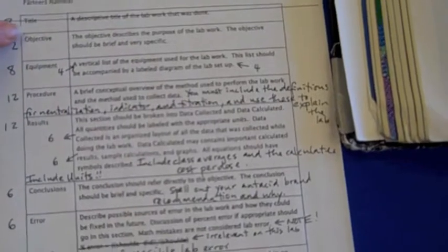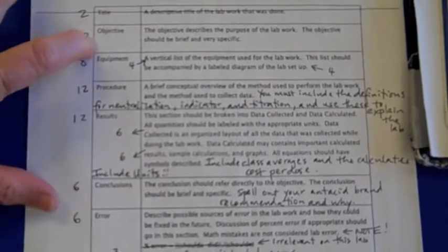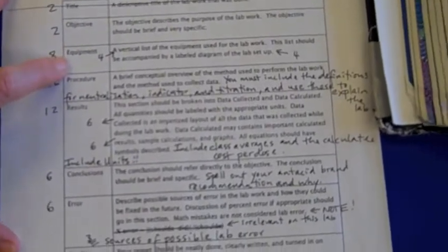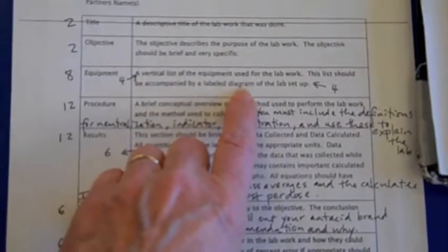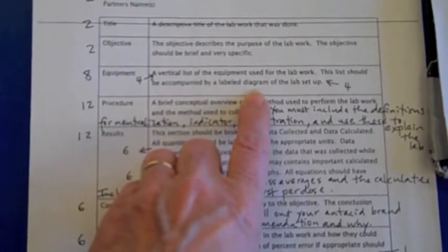So when you write up your lab, you need to make sure that you follow this format on the lab. You're going to have your name and partner's name, the title of the lab, the acid-base titration lab, the objective, which is to determine which tablet is most effective at neutralizing, a vertical list of the equipment, and in this lab it also asks for a labeled diagram. We've seen them where people have done that labeled diagram as a sketch or as a photograph, however you want, but you need a labeled diagram.